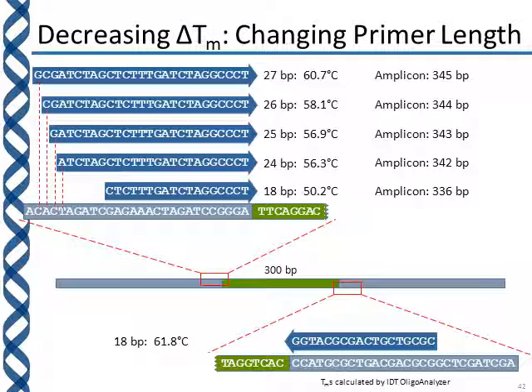If you don't have the flexibility to move your primers, you can just extend them out a little bit. And so in this particular example, I increased the length of the forward primer. If, for example, we wanted to, instead of bringing the forward primer's TM up to that of the reverse primer's TM, we could try to bring the TM of the reverse primer down to that of the forward primer. In this case, that would entail shortening the reverse primer.